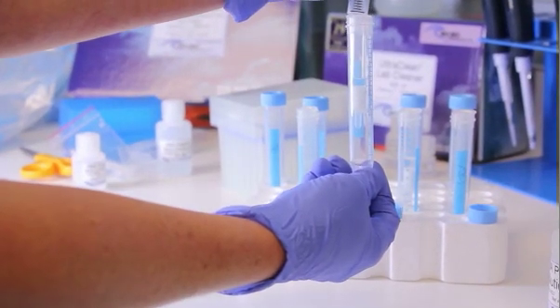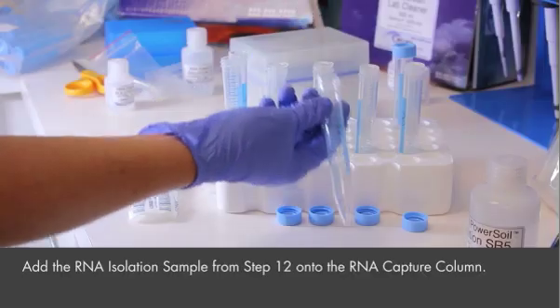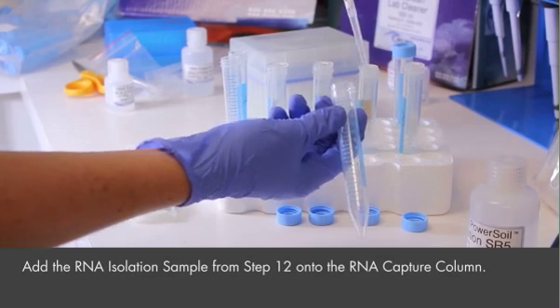The flow shouldn't be higher than one drop per second. Add the RNA isolation sample to the column. Again, increase the flow if needed.